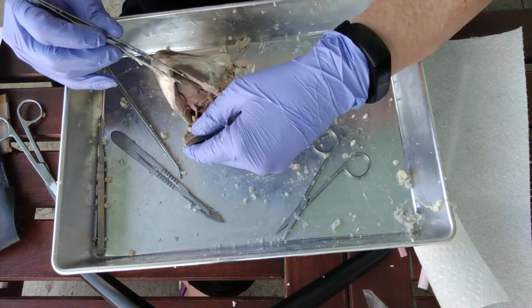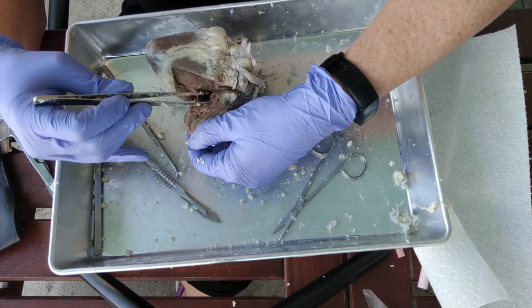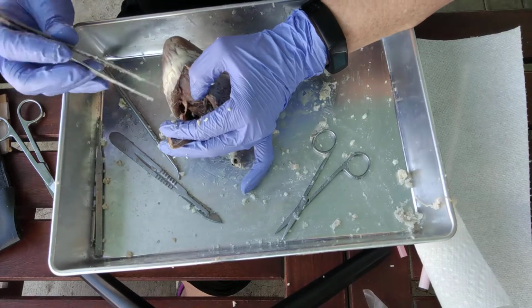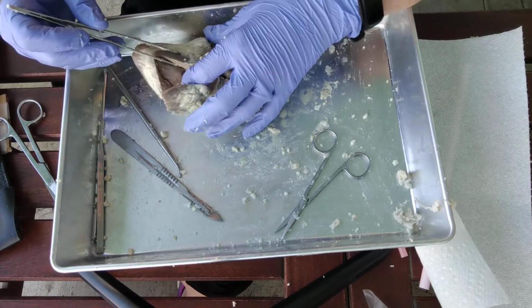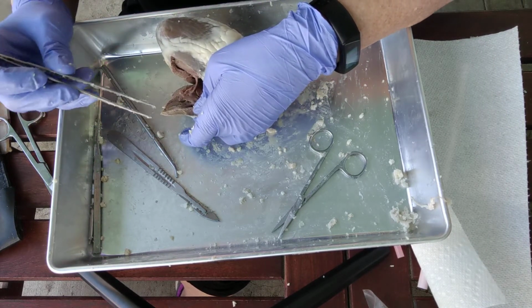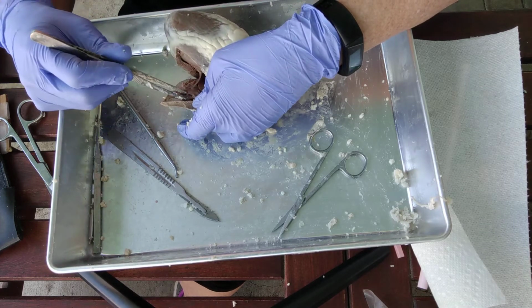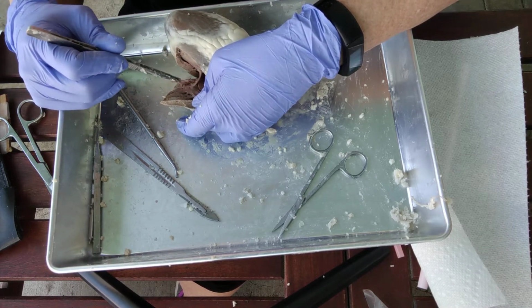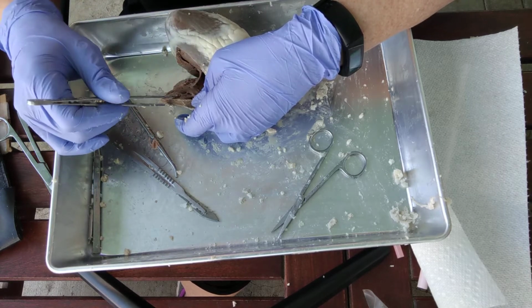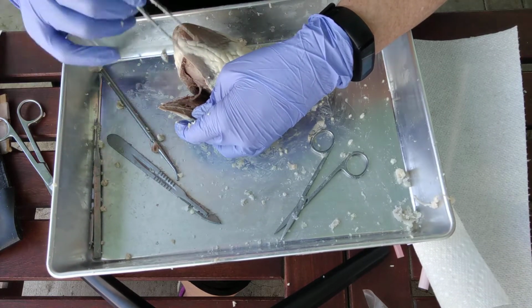Okay, so I want to go ahead and talk about this texturing here. So see how this right here, it has strings attached to it, that's the papillary muscle. You can also see some texturing on the walls of the ventricle. See how it has like some kind of folds in there? Those are going to be the trabeculae carneae, and they do not have strings attached to them. They're just folds, like texture in the muscle on the side of the heart, and the side of the ventricles, I should say, both ventricles.